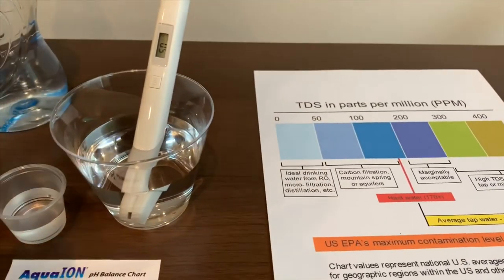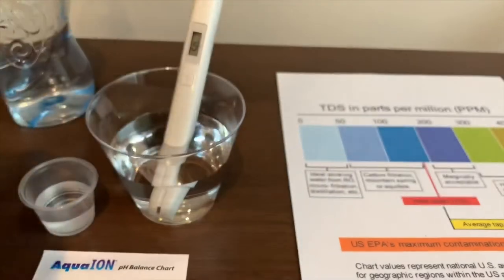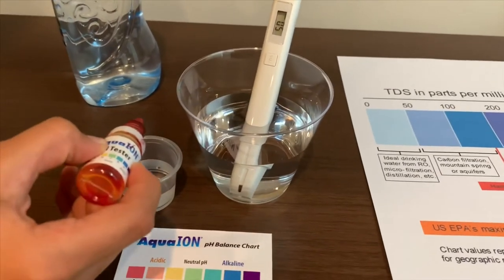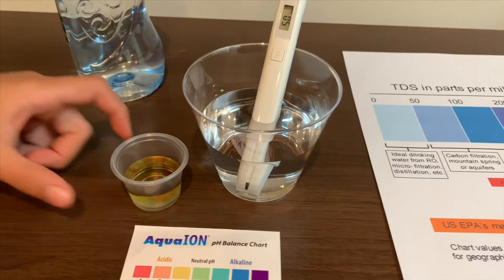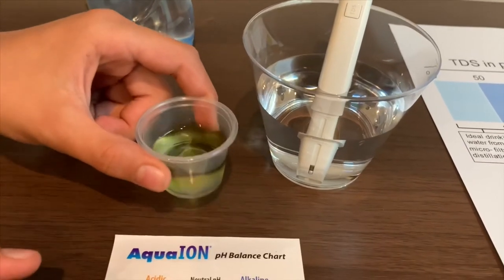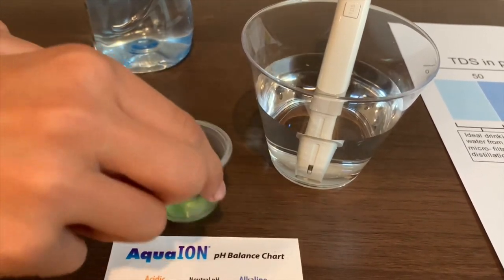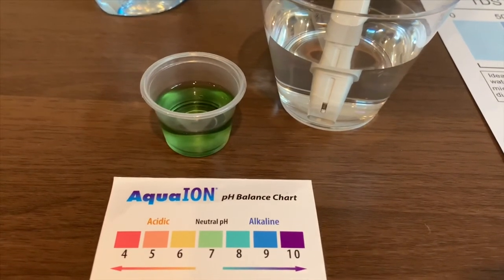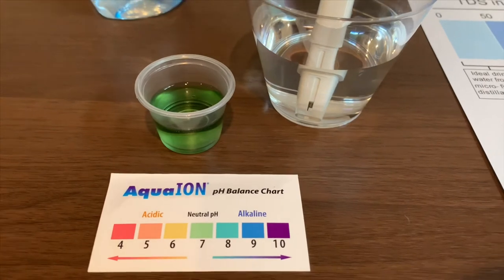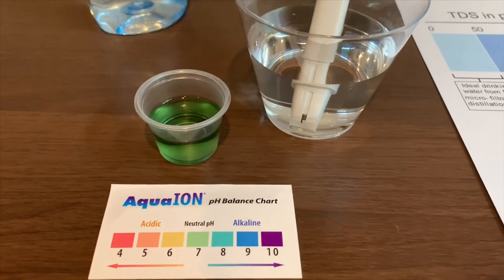Now let's test the pH. Two drops only. That is 7 — so that is natural pH.